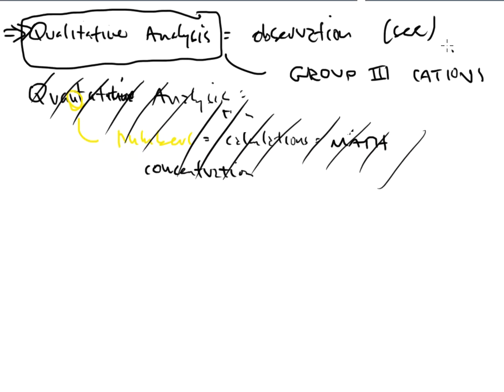Oh gosh, what is all of that mess? Okay, well, here's the deal. If you've not taken a general chemistry class yet, that's fine. There are two things in the laboratory environment that are called cations and anions. This comes from the term ion, hence cation and anion.